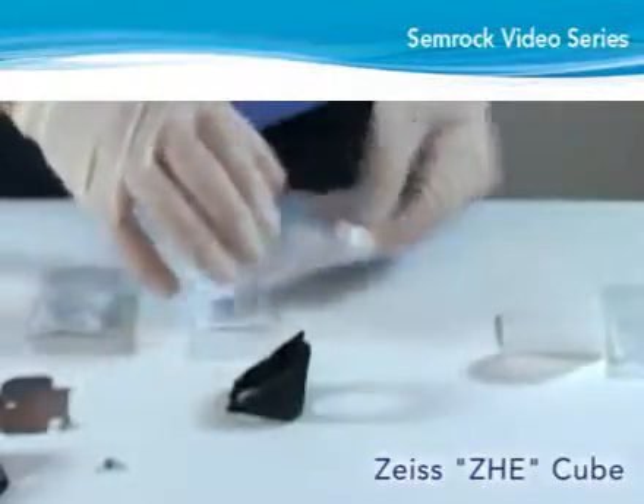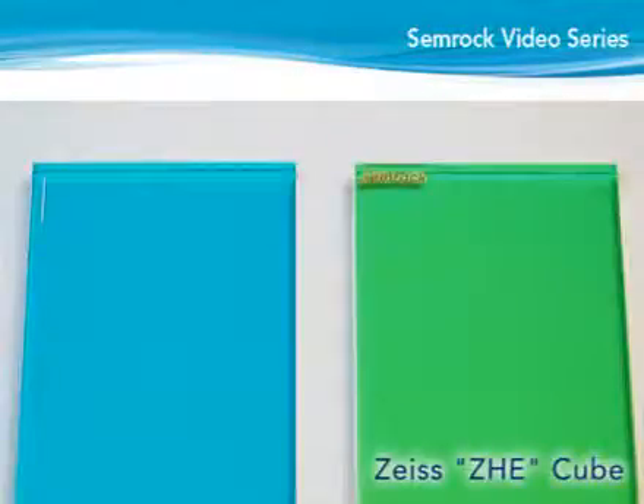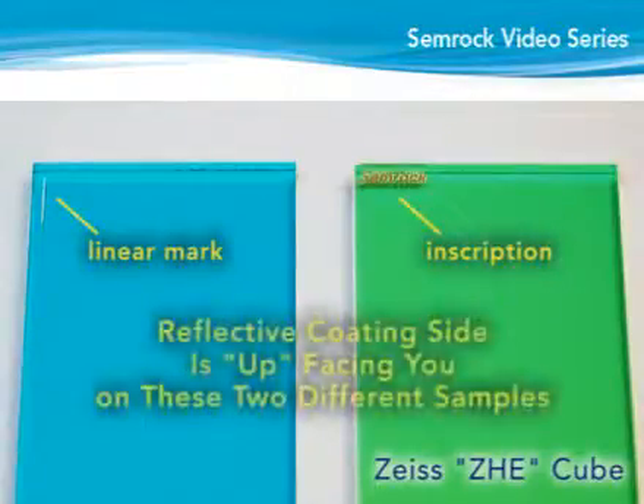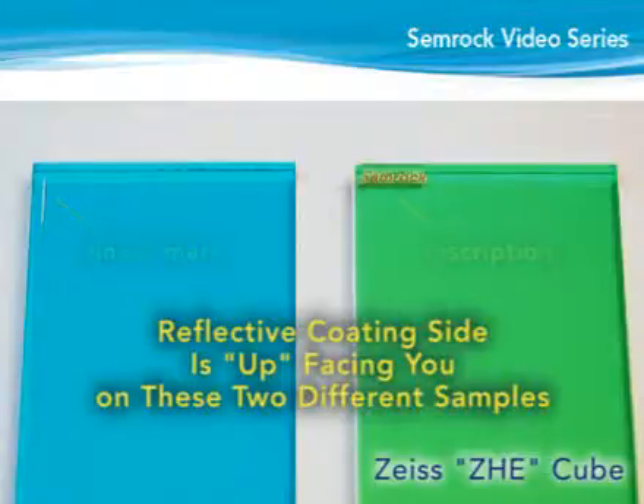Next, determine the reflective or coated side of the dichroic for proper orientation in the cube. If the dichroic has a small linear mark or inscription in one or both corners, the reflective coating side is facing you when the long side of the dichroic is vertical and the mark is in the lower right or upper left corner. If the dichroic does not have any marks, lay the filter flat on a clean white surface and look at the far edge of the glass. If the edge is not easily distinguishable through the top side of the filter, the reflective or coated side is up. If the edge appears white or uncolored, the uncoated or anti-reflective side is up.